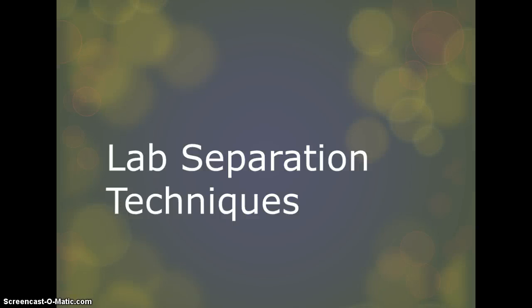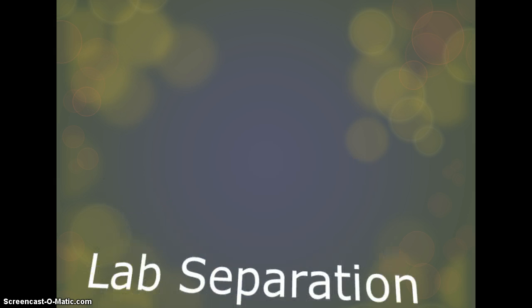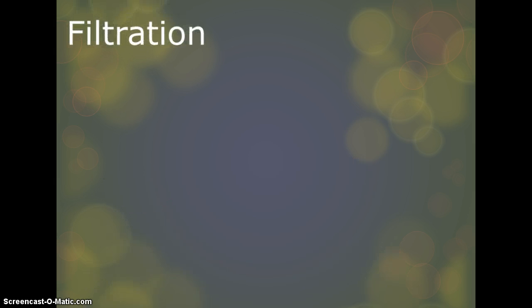This lesson is on lab separation techniques. And our first technique is filtration.